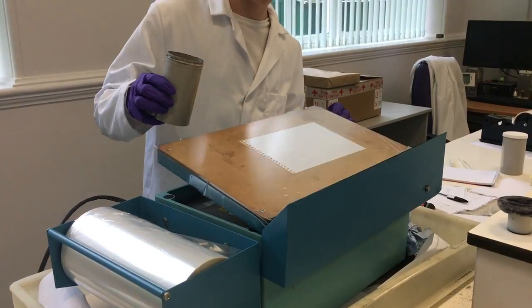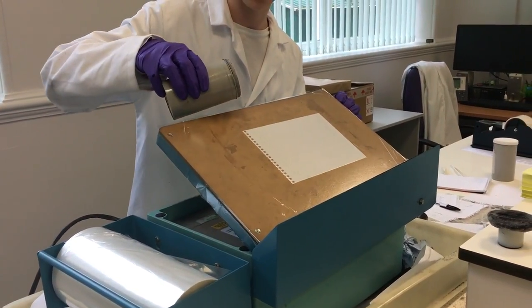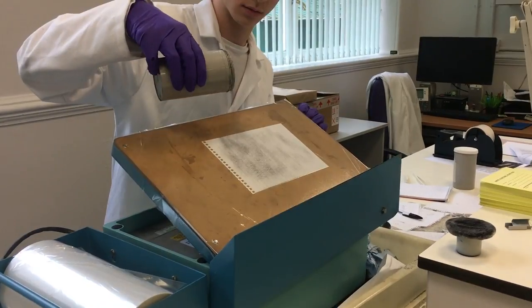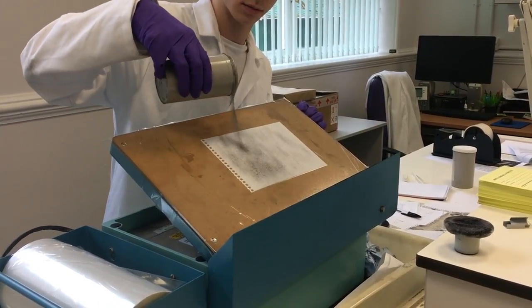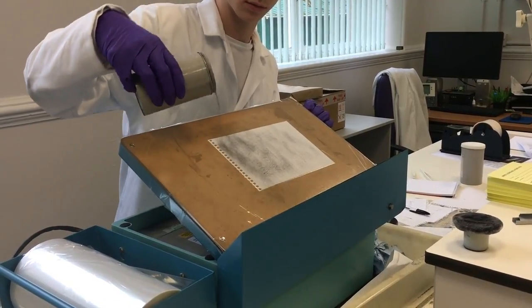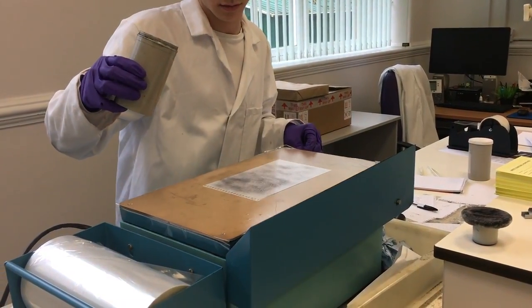Photocopy toner is then passed across the film. The stuff in the tub consists of tiny plastic or glass beads with photocopy toner mixed in. The toner then adheres to the indentations that have been created in the film and produces a visualization of the indentations without affecting the actual piece of paper.